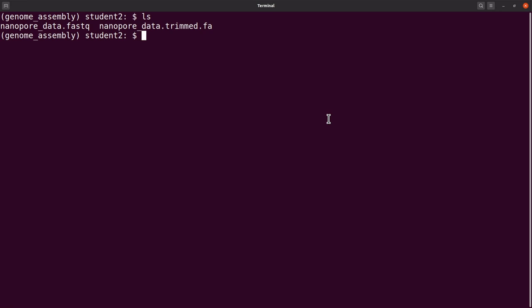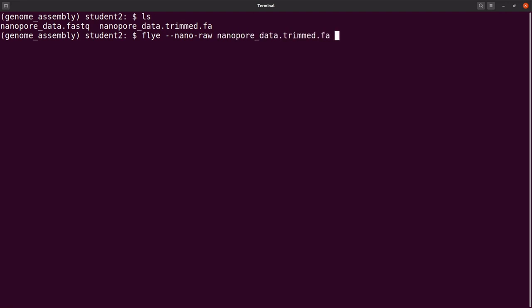Let's call Flye and then we indicate nano-raw. This tells Flye that the data we are inputting is nanopore data but it's raw reads. We specify the file, which was nanopore_data.trimmed.fa. Please take note that Flye can also assemble reads that are in the fastq format, so either fasta or fastq, you can use any of those formats.